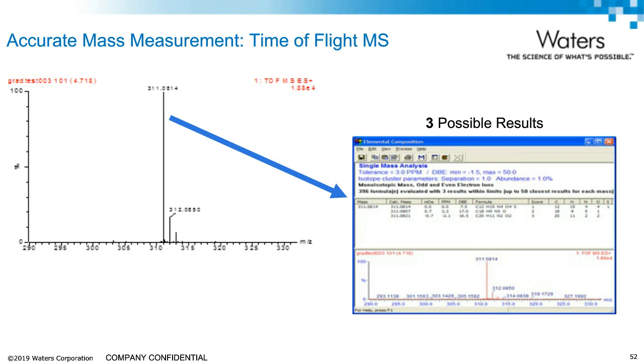If we know sulfadimethoxine, for example, is in our sample, we could use this information to confirm its presence in the sample since we know its formula and have at the top of our list of possible formulas a hit matching its protonated molecular formula.